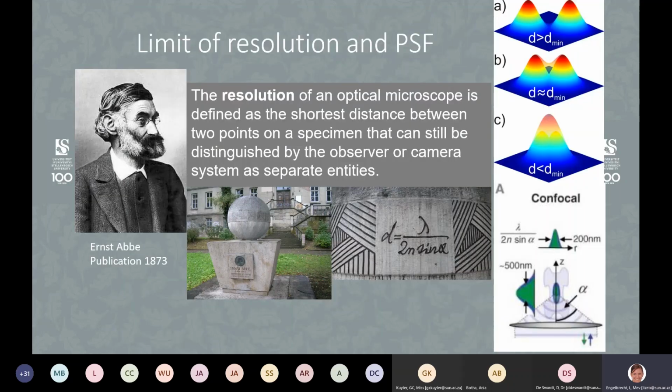So what is super resolution? Why is it important? Why is it there? The first person, or the person whose name is coming up every time we talk about resolution, is Ernst Abbe. Now, Ernst Abbe was involved in the foundation of ZEISS. He and Carl Zeiss worked together, and with the ZEISS people, Anya and Sune might even give you some nice background on him and history.